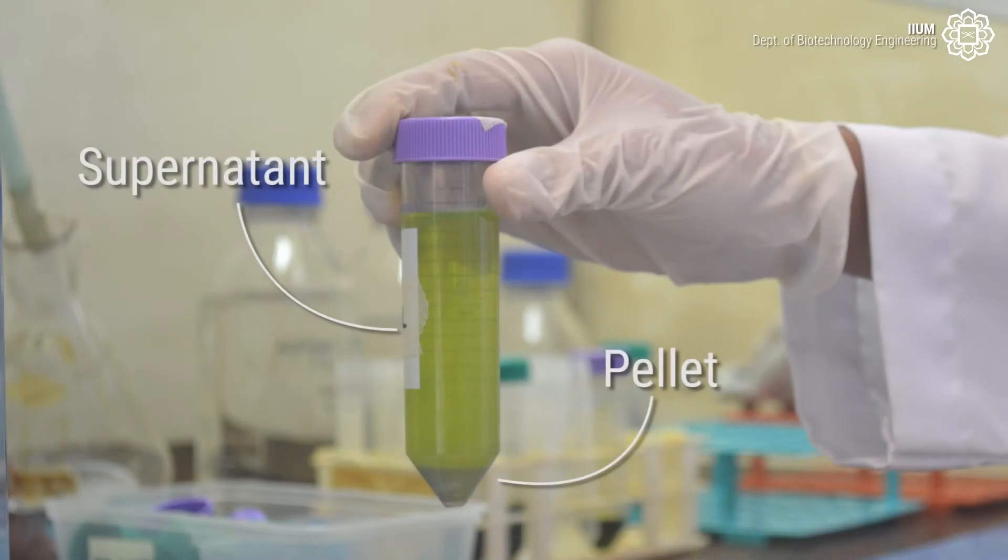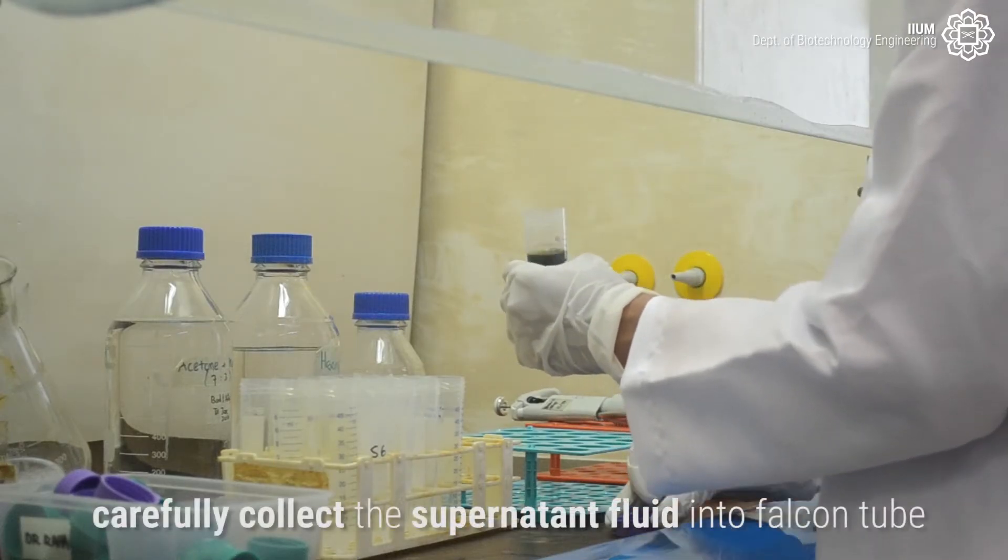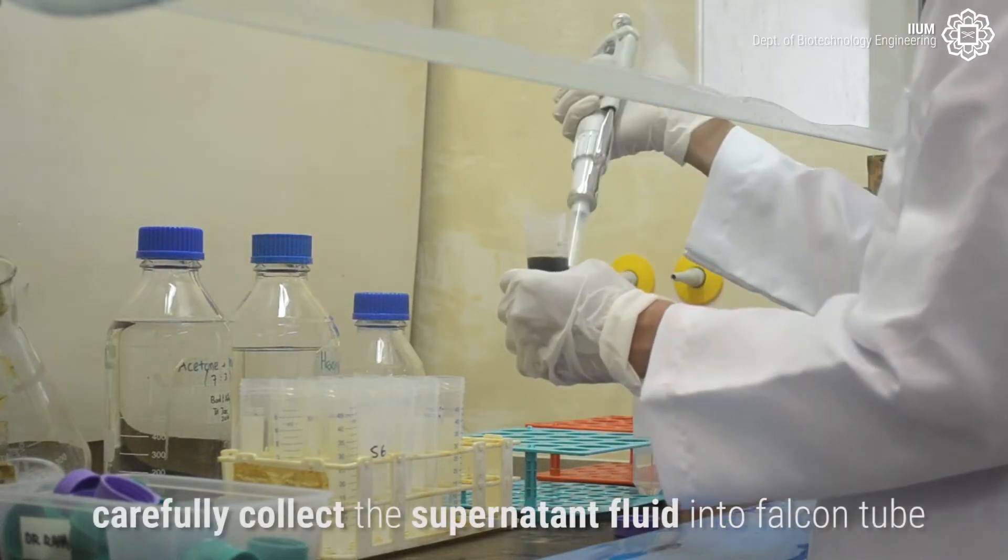After centrifugation, the pellet is separated from the supernatant. Carefully collect the supernatant fluid into a falcon tube.